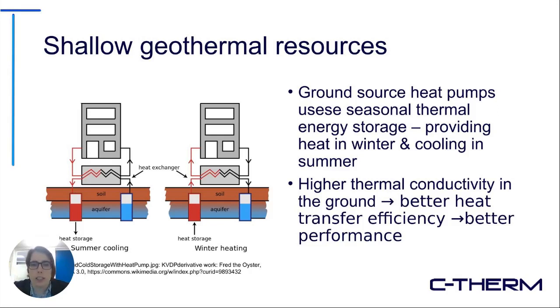Usually for the more industrial level applications, you'll get into some of the deeper ones from what I've read. When you're looking at geothermal applications, higher thermal conductivity of the reservoir material gives better heat transfer efficiency in the heat pump system, which in turn leads to better geothermal performance of the heat pump.